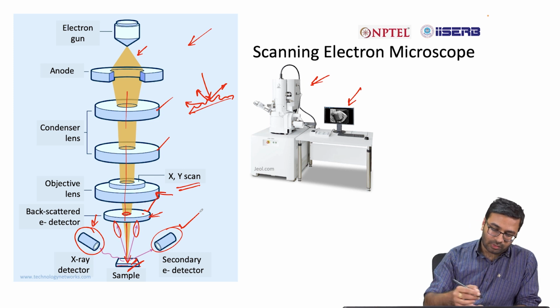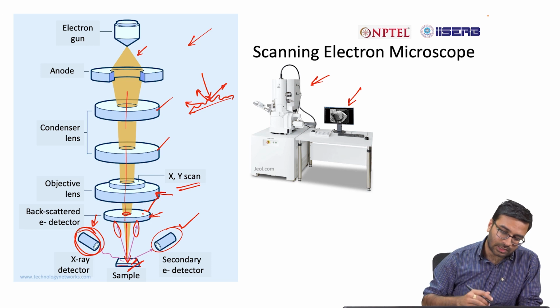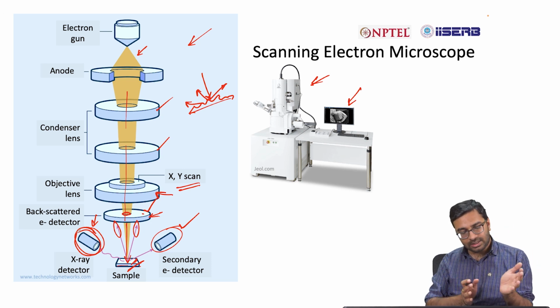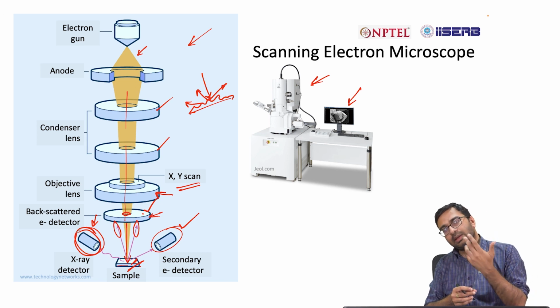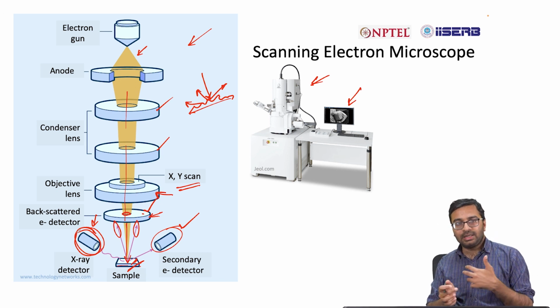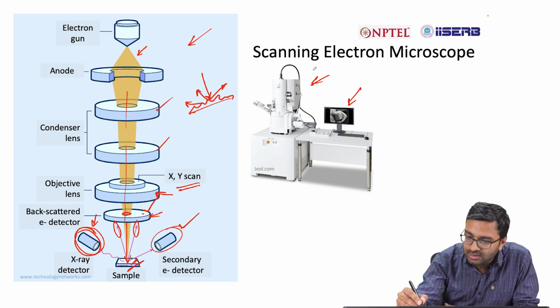In fact, in most cases the system also comes with an EDS, so it also detects the reflected X-ray and can give you the details regarding the material present on the sample, right. So this is the system, how it looks like.